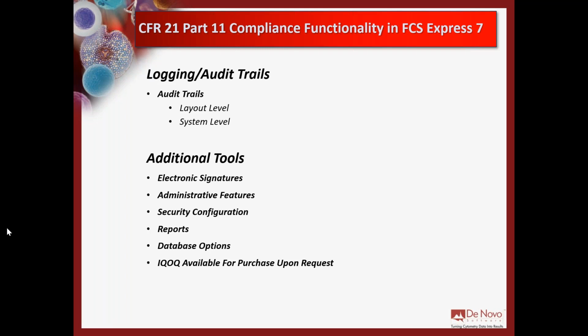Additionally, you're going to see electronic signatures in the software, administrative features, security configurations for how passwords and notifications are handled, full reports, and importantly, we have different options for databases. So if you think about it, when we create things like security groups and layout groups, we create signatures and things like that, we have to have some sort of database to keep track of all of this security information.